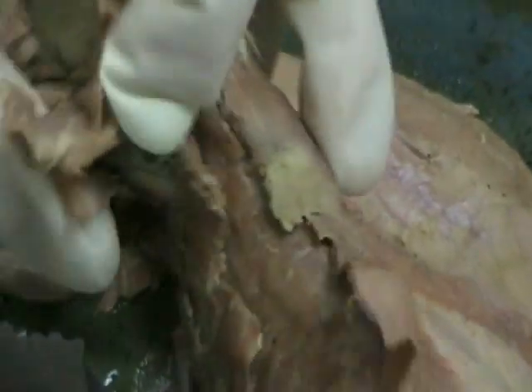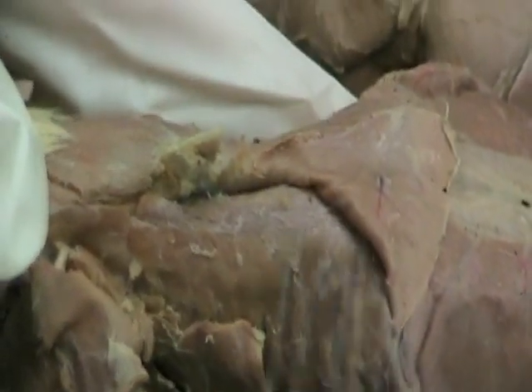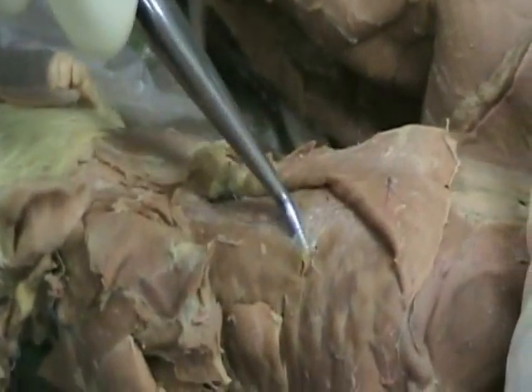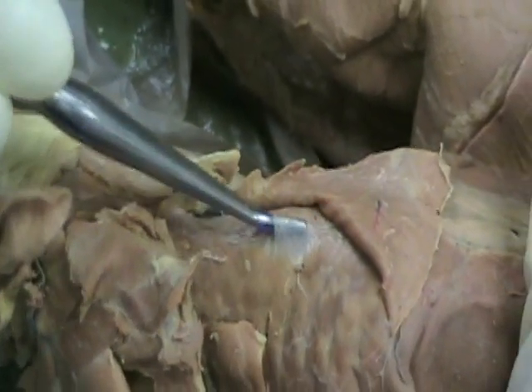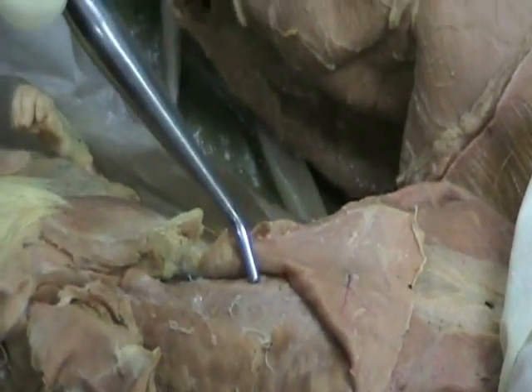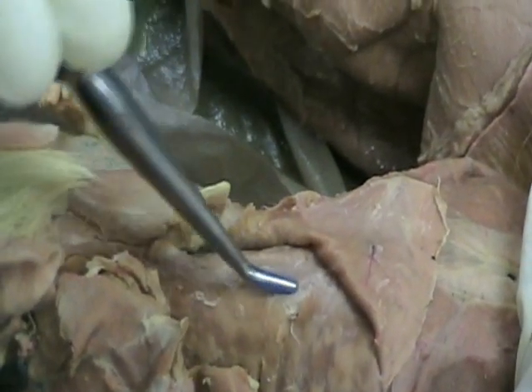Okay. When you cut the latissimus dorsi and the thoracic trapezius, you will look more clearly here at the serratus dorsalis, and if you find a spot, you can see that from the muscle. So see how when I go under it, it's pink. It turns clear. Mm-hmm. This is an aponeurosis because it's like a sheet of connective tissue to the spine or wherever it's going.